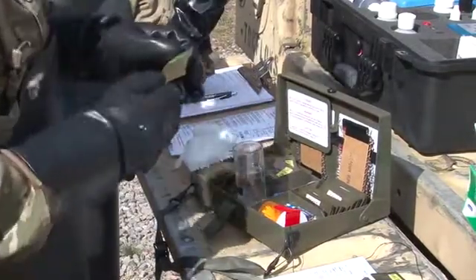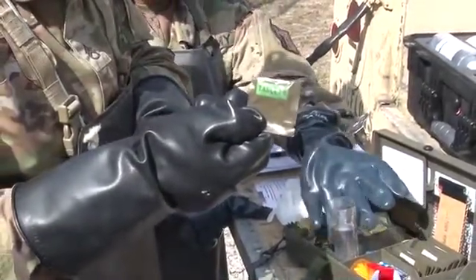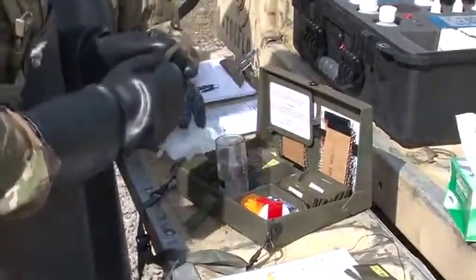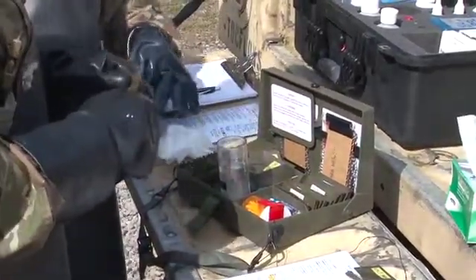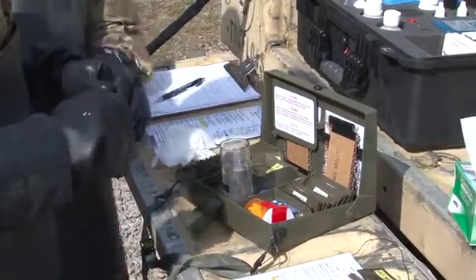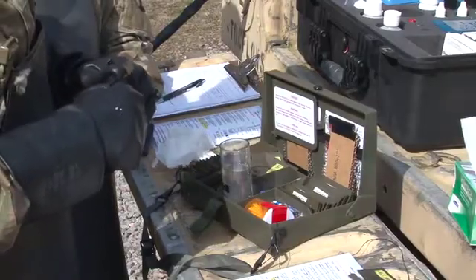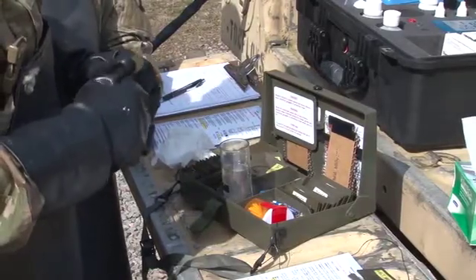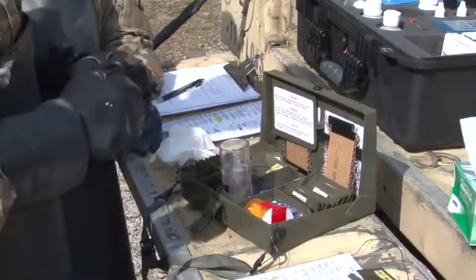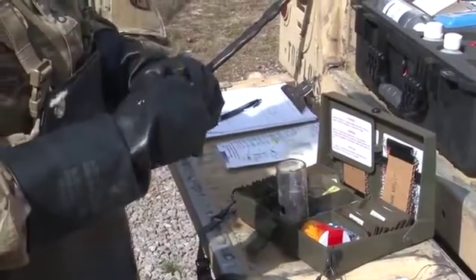Remove a green labeled tablets packet from the kit. Now is the time to remember your water temperature results. If your water was less than 50 degrees Fahrenheit and considered cold, then you would break up the tablets in the green label packet before opening, using only gloved fingertips. If the water temperature is considered hot, which is between 105 and 125 degrees Fahrenheit, foaming may occur and could wet the beads in the tube.